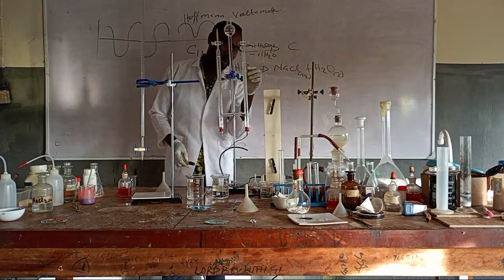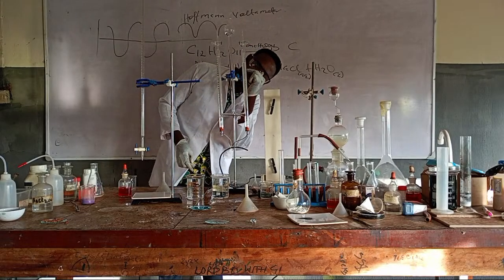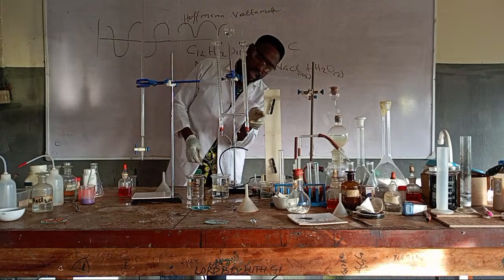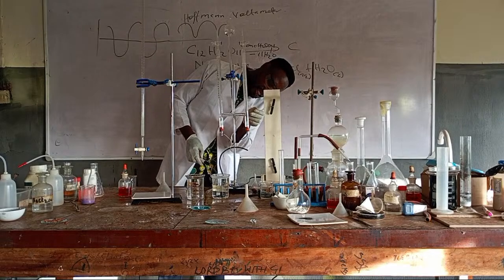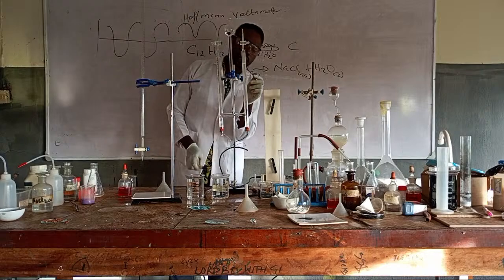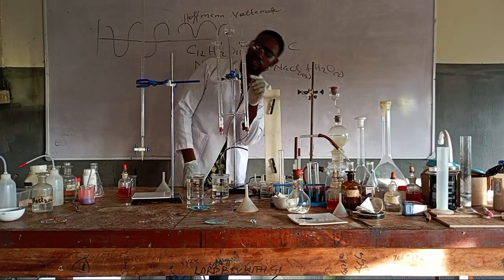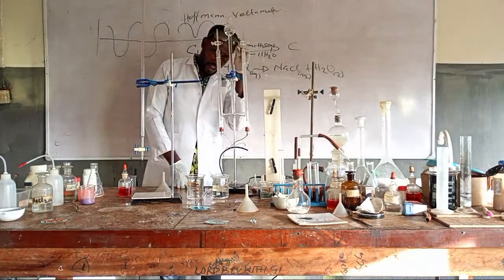The thing is moving down. This is now at 3. The thing is calibrated from 0 to the highest. 0 to 50. So when I say it's going down, it is producing more. This should be 11. If all things being equal, this one is supposed to be 5.5.